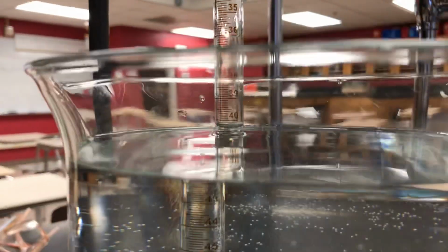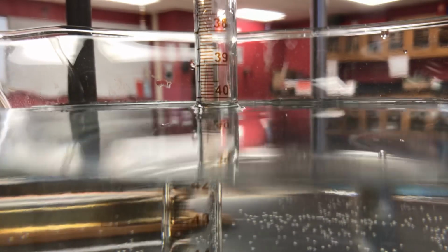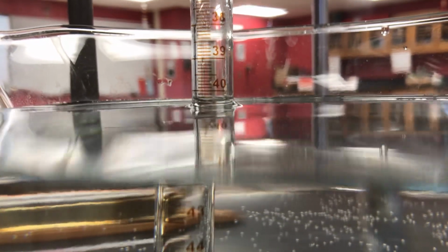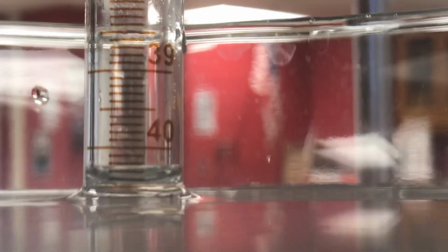Are we right on the bottom? Pretty close. No, you're not even on the bottom either. Okay, so now you'll have to help me, Mr. Moore. Pick it up just a little bit so that we can see the liquid level inside. Okay. Can you see that? Looks like the bottom of the meniscus, 39 is above 40, so the liquid level in the eudiometer is between 40 and 41, and it looks like it's just below the 40.3, which means it's greater than 40.3. Pick it up just a little bit.